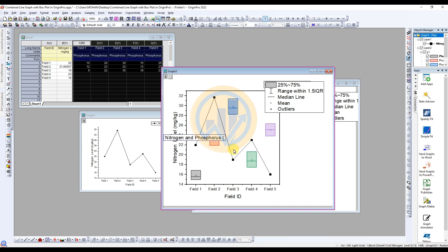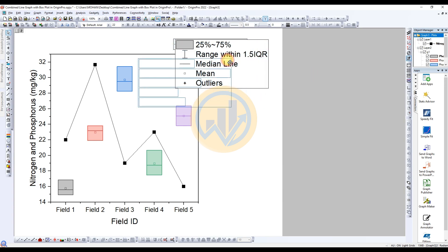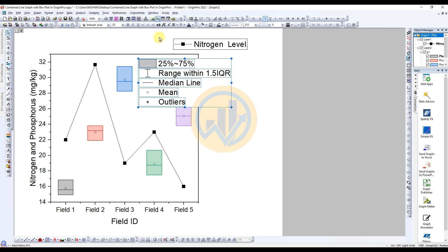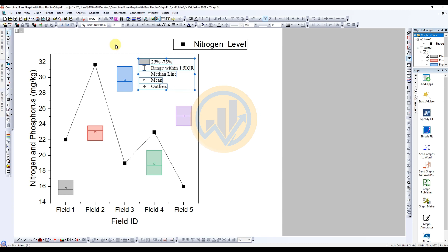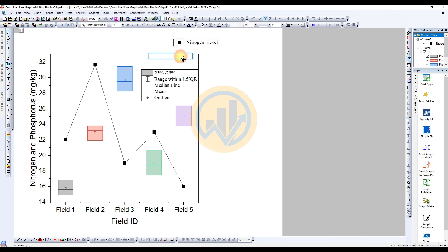Set the units — milligram per kilogram. Then select the data. Now customize the combined line graph with the box plot. Move the legend. Change the text format to Times New Roman, size 14. Also change the line graph legend font to Times New Roman, size 14, and move the legend.